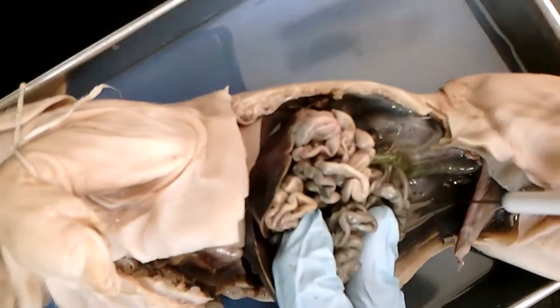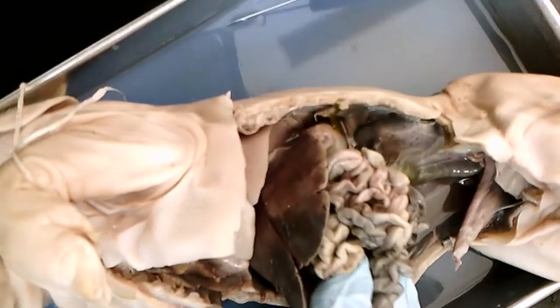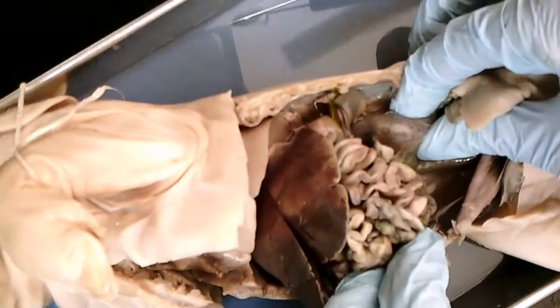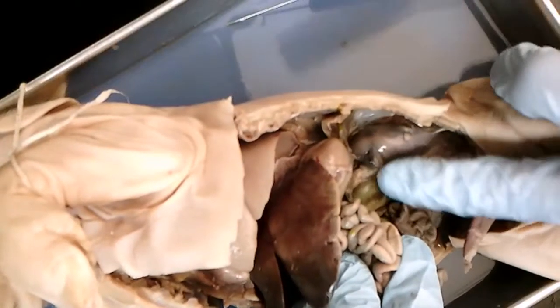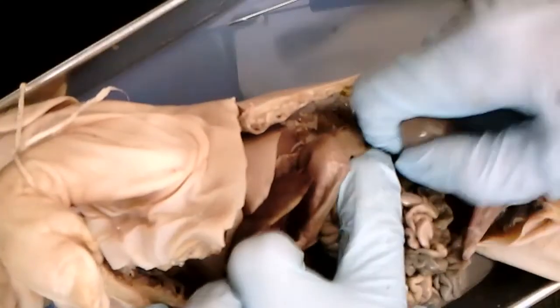So I think the kidneys could be a potentially difficult one for students to identify. They're embedded into the back wall of the abdomen. They don't stick out like the rest of the organs. But if they move the intestines around a little bit, that's when they're going to be able to identify the kidney and see it. But it is possible that they kind of just look over it for the reasons Matt just said. But if you start cutting through some of the tissue, you can actually remove the kidney with your fingers pretty easy.